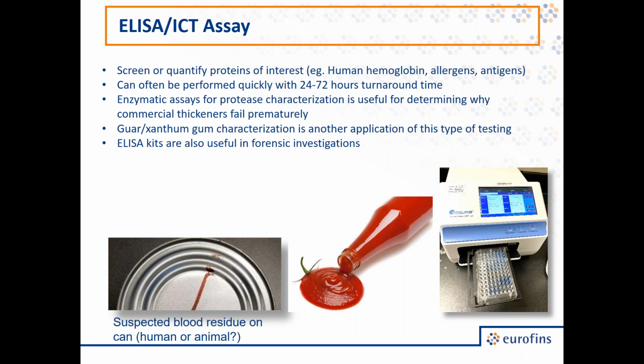So there can be large vendor quality legal claims. So ELISA kits are very, very useful for all aspects of forensic insurance and legal work.